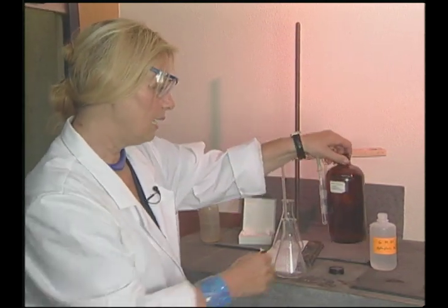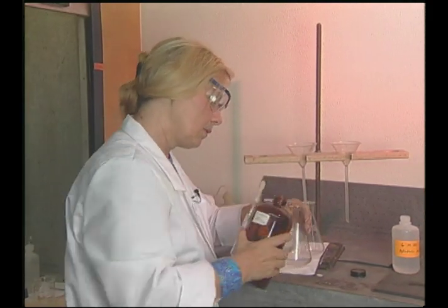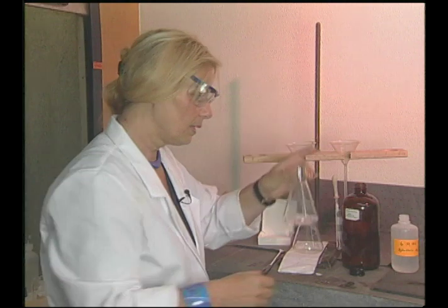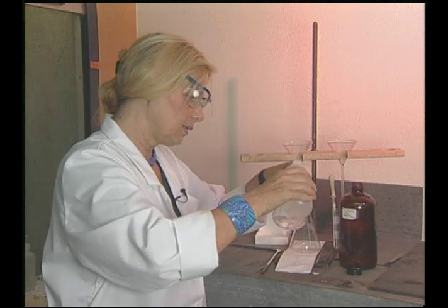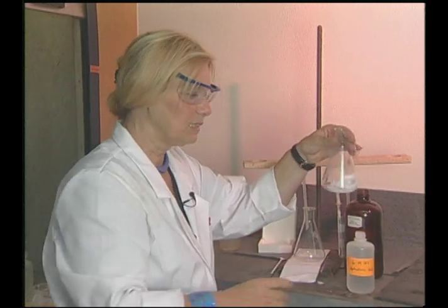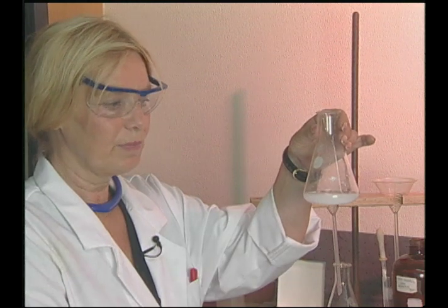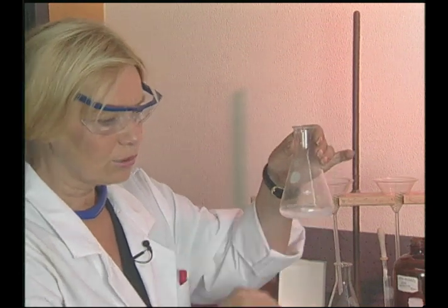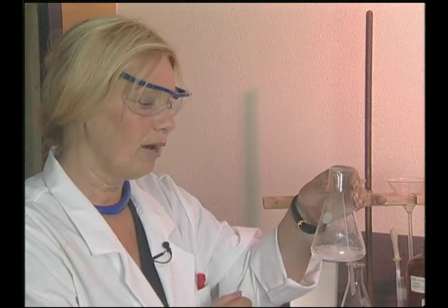We will take lead nitrate solution, which, as you can see, is a clear solution. And we will add chloride ions coming from hydrochloric acid. And we will see that instantly a precipitate forms. You see the cloudy white solution here. It is opaque, that means not transparent anymore. And you see it already settles to the bottom very readily. But this is of no use to us. We need to separate it out.